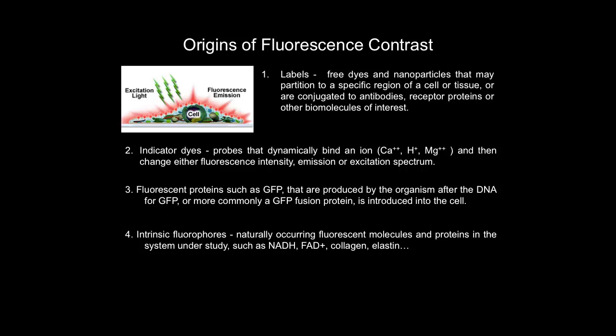So very importantly, these are exogenous dyes. These are external agents that you add to the tissue to be able to light up different components in the tissue, like nuclei or cytoplasm or some fibrillar structures, really what you're interested in imaging.